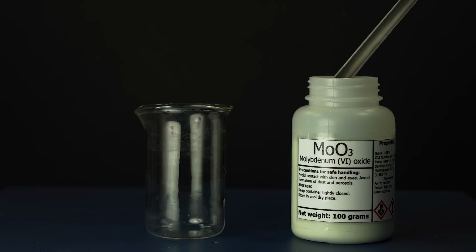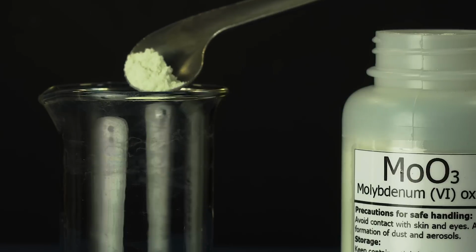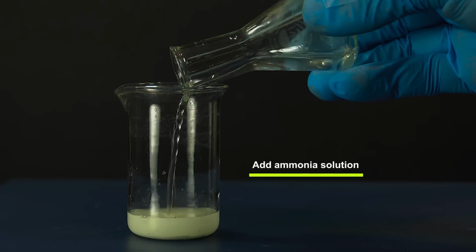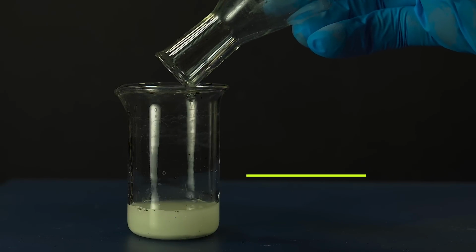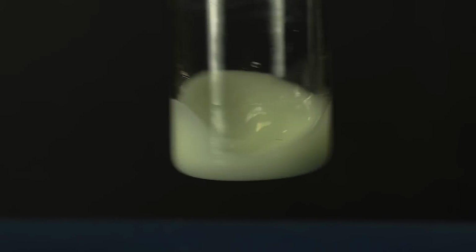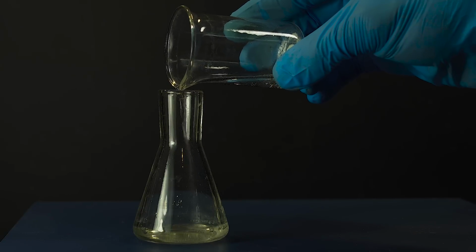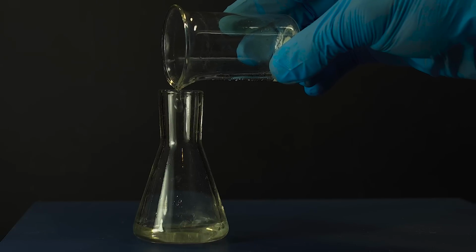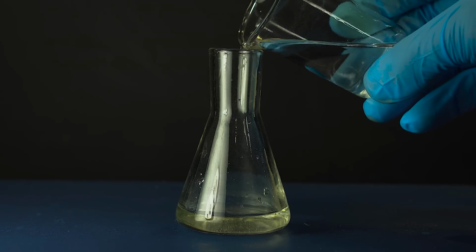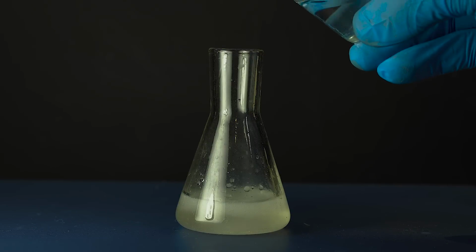I didn't have ammonium molybdate, so I had to prepare it. The method is very simple. You need to prepare a concentrated ammonium solution of molybdenum trioxide. Then decant and dilute with acetone. Ammonium molybdate is insoluble in acetone, so it gets precipitated.